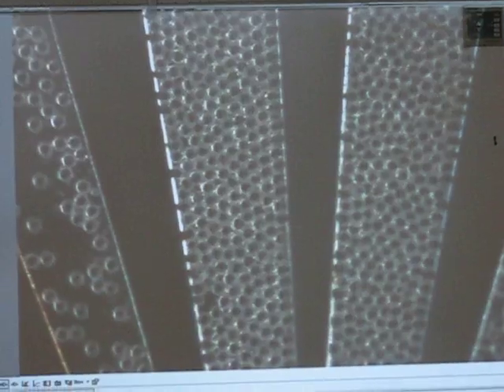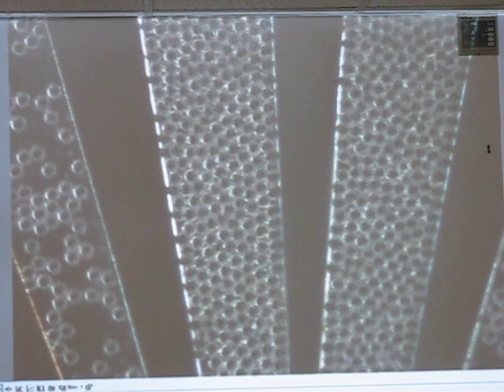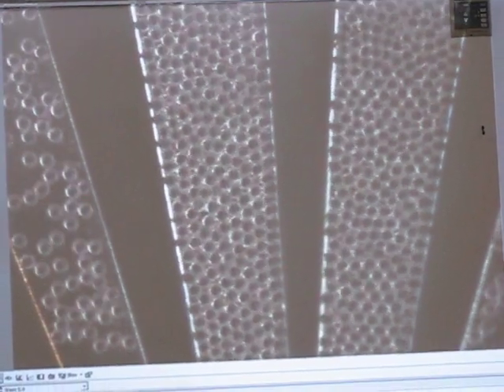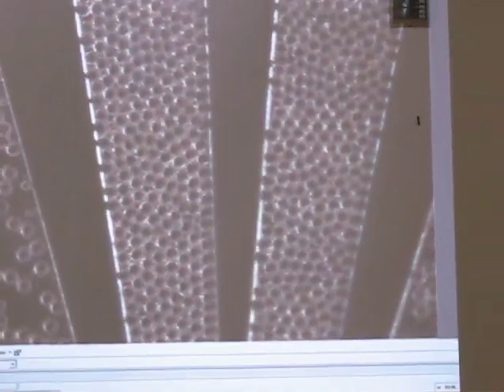So, these are basically bubble traps. Yeah, if I may call it. And this is where they are going out. So, basically, we would generate bubbles in a fluid. And then we trap them and they're all the same size and we can use the ones we have trapped.